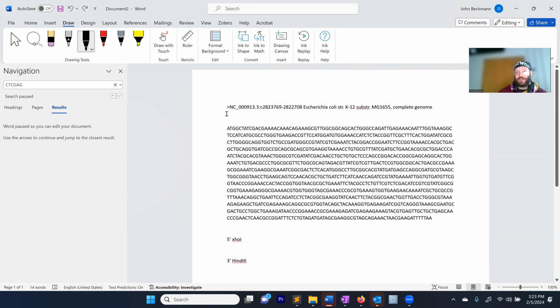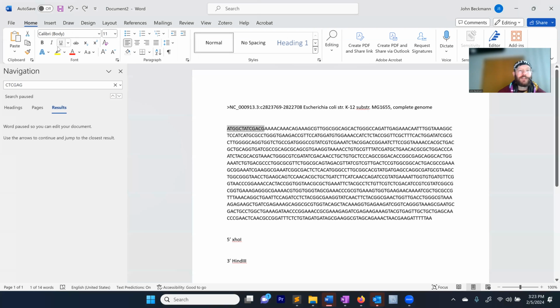If I wanted to, I could pull more sequence upstream and potentially clone in the promoter region, or potentially clone in the terminator region 3'. But many times when you're cloning and popping it into a plasmid, you really just want crisp edges right at the start codon and the stop codon. So as I design these primers, I know one is going to be somewhere around here, so I'm restricted in my placement. And I know one is going to be here. So my primer is going to be here and here. The question is, how far should I go, and on what base should I stop? The longer you go, the higher the annealing temperature is.